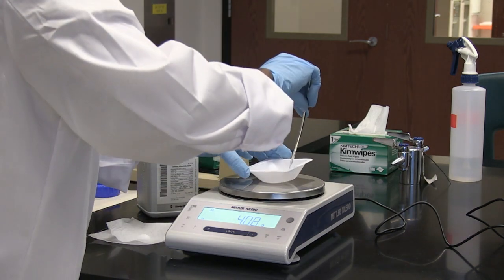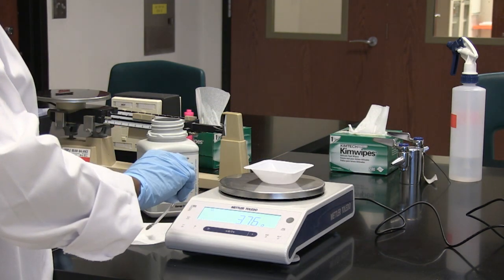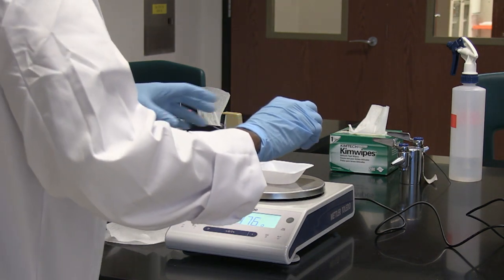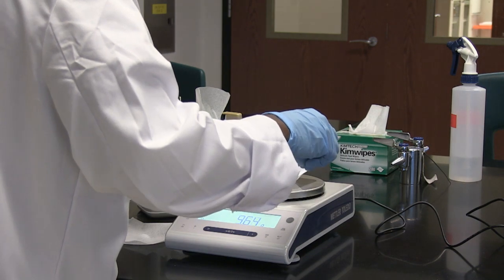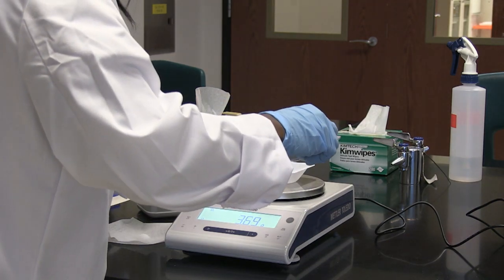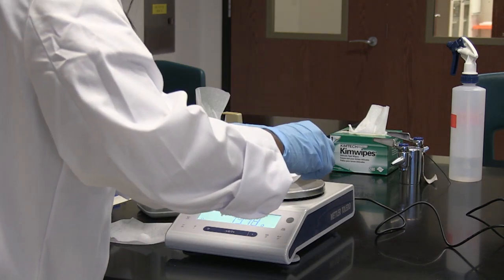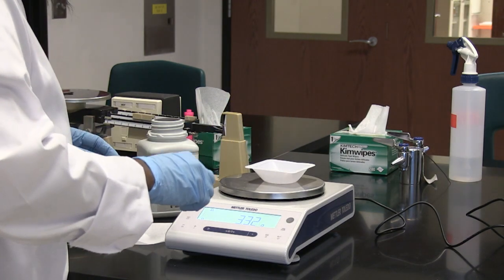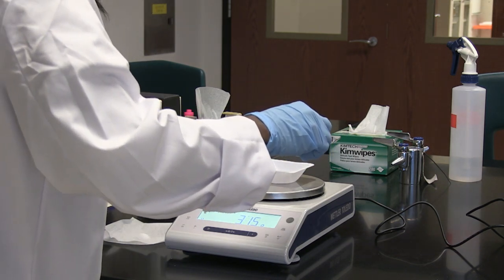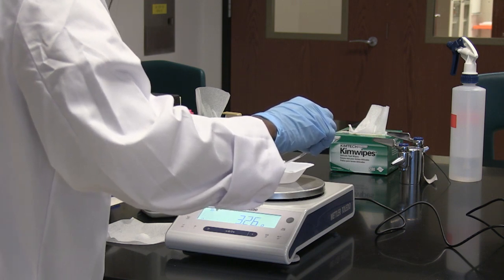The reading keeps going down the more I take out. So it's at 3.75, between 3.75 and 3.76 grams. So I take out more because I want it to be 3.22. So it's 3.15 now, so I gradually add a little bit from the spatula to get it back up.